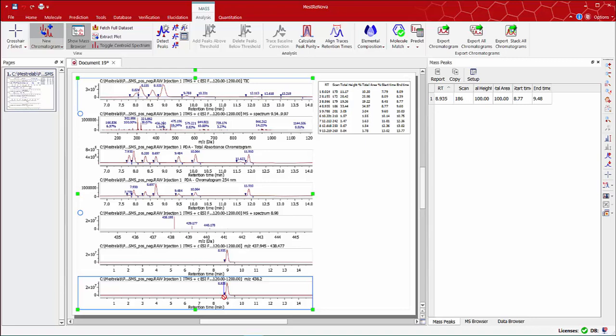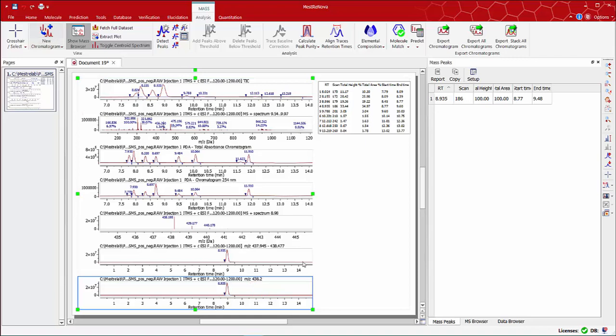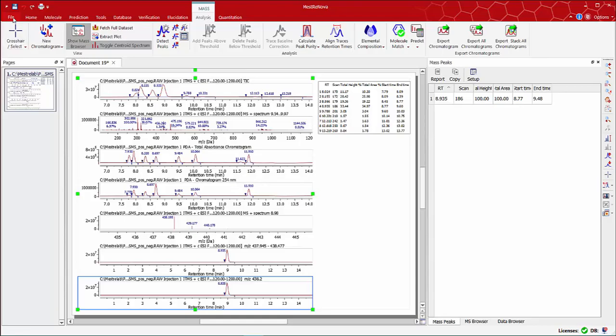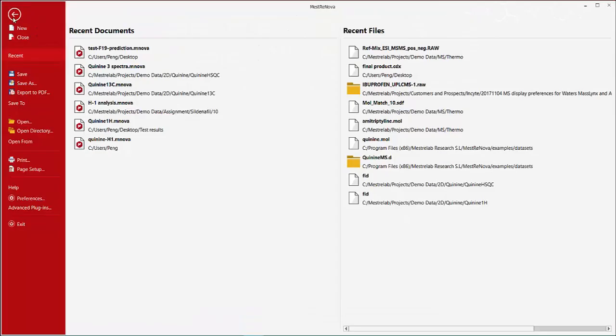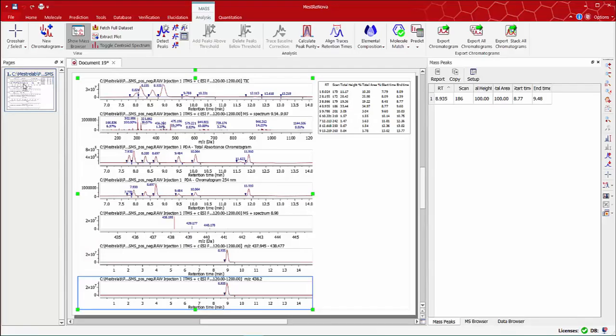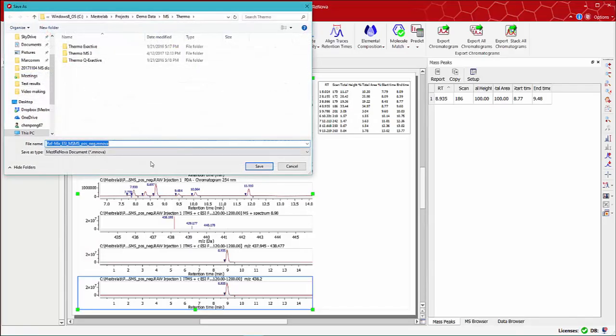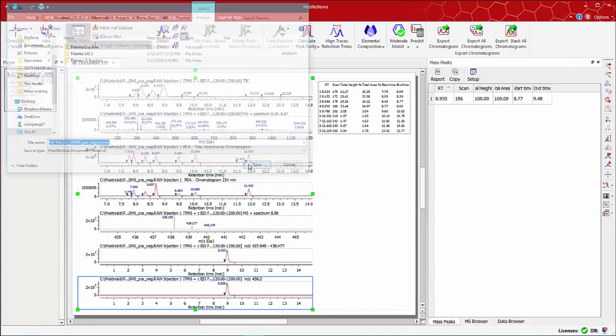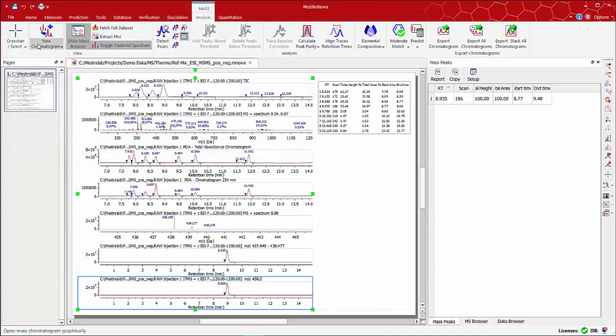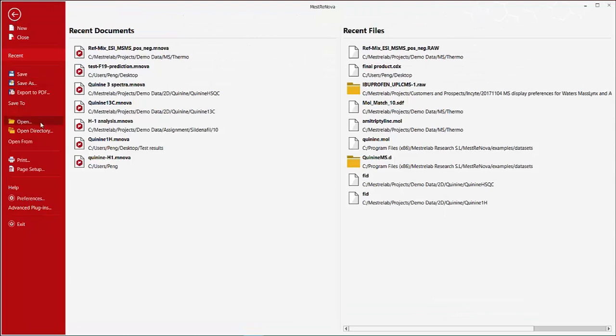To conclude this basic part of the MNOVA MS plugin description, just mention that any individual object selected from the main window can be copied into your preferred reporting system, PowerPoint, Word document, etc. You can save it as an MNOVA document, or you can generate a PDF report using the Export PDF option.